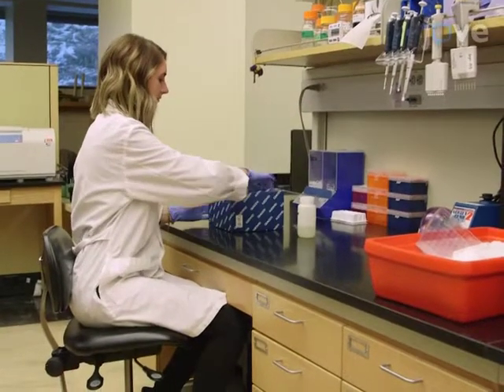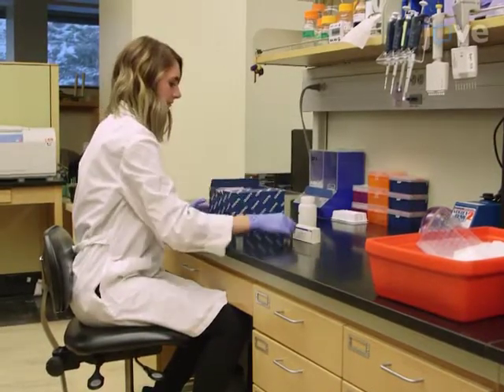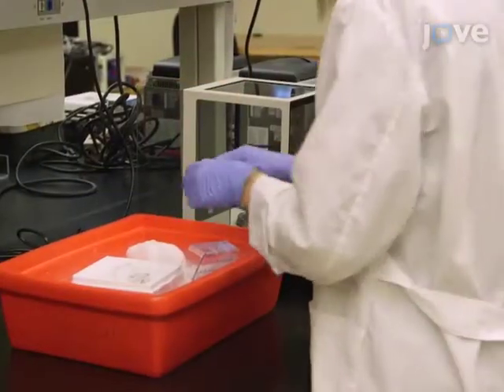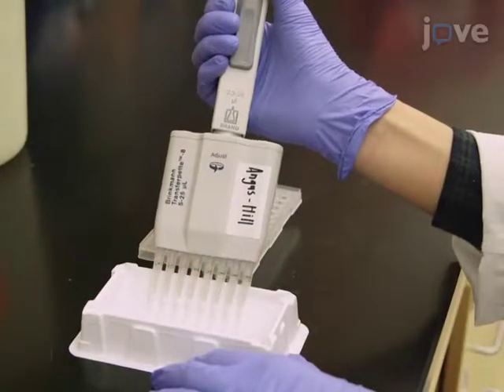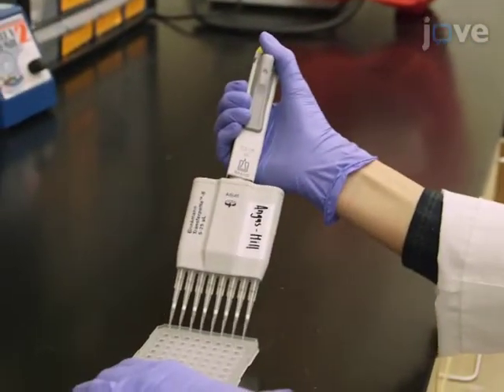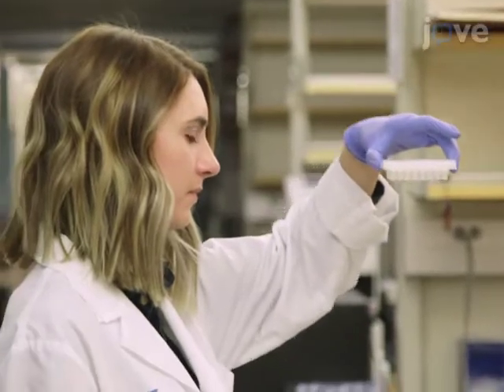Utilize a commercial kit to isolate microbial DNA from the stool following a stool pathogen detection protocol. When doing so, transfer the samples from the -80°C freezer on dry ice and weigh them. Next, set up a PCR that amplifies the microbial DNA as described in the text protocol. Then clean up the reaction products using magnetic beads.